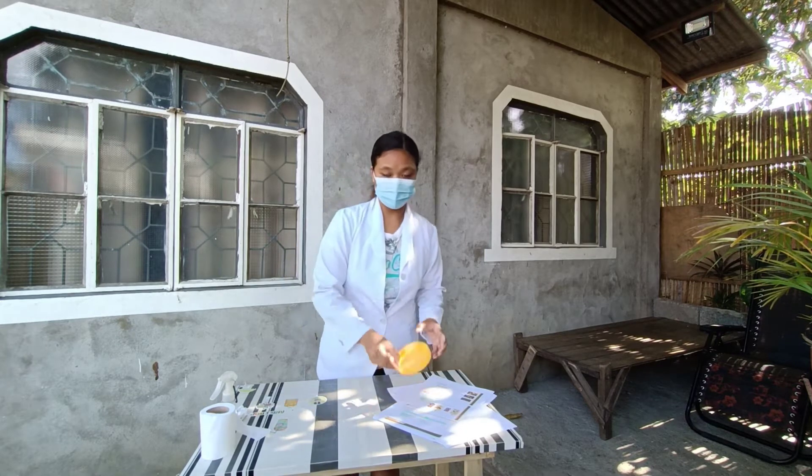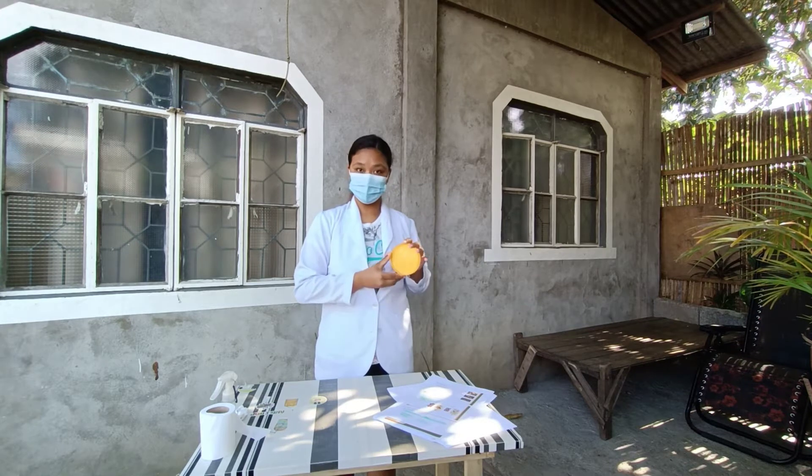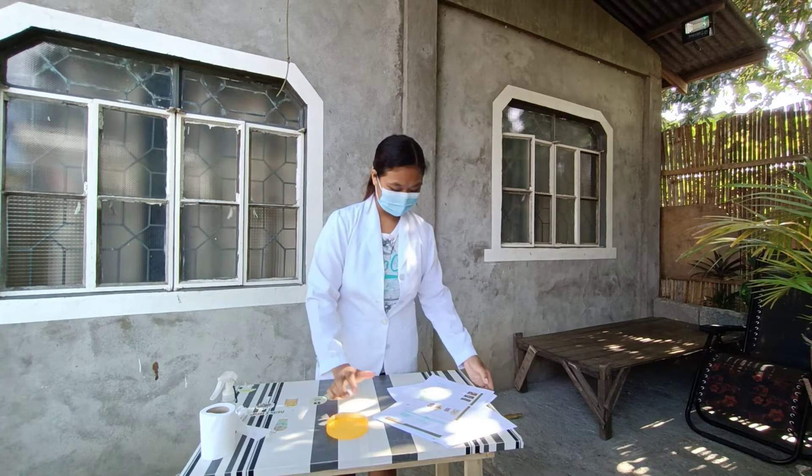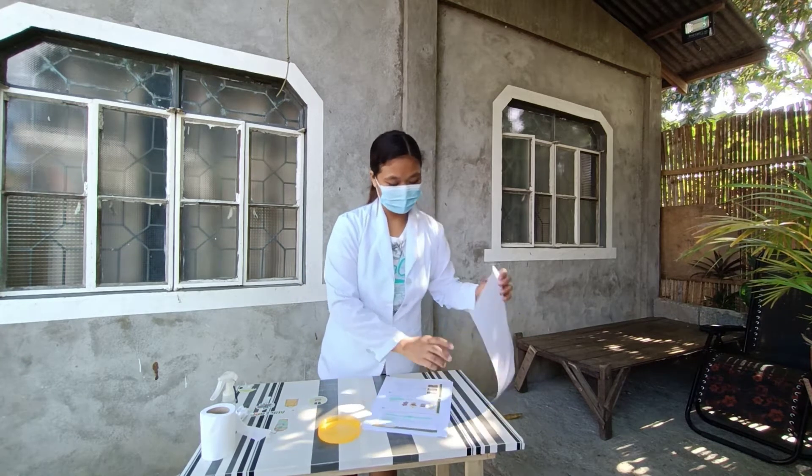In wrapping the petri dishes properly, we need a petri dish. I used an improvised one. And then lastly, a clean sheet of paper or a recyclable one.